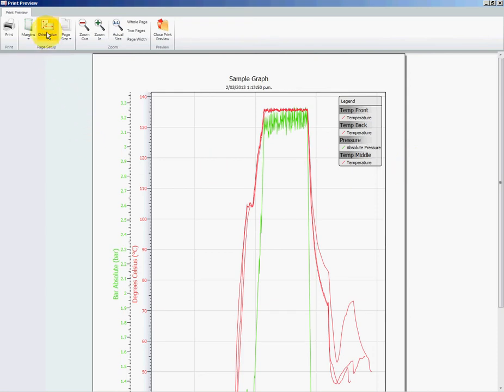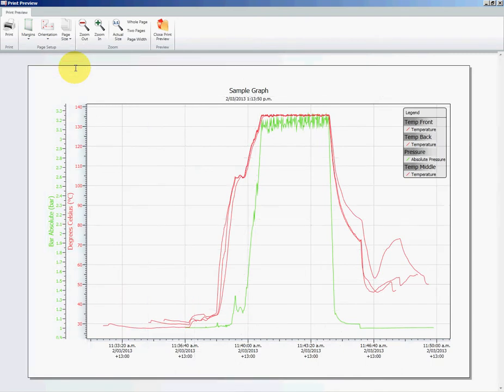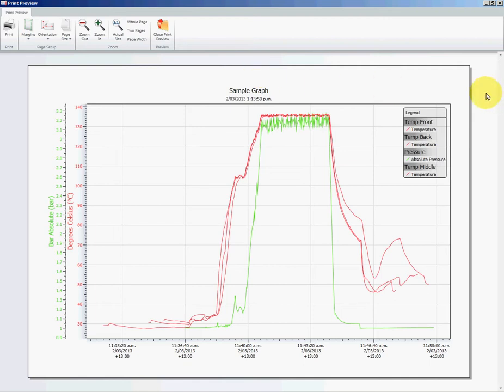If we select the orientation here, we can change that to landscape, which is how I personally prefer to have it, and the title of the graph is what we entered when we first created the graph.